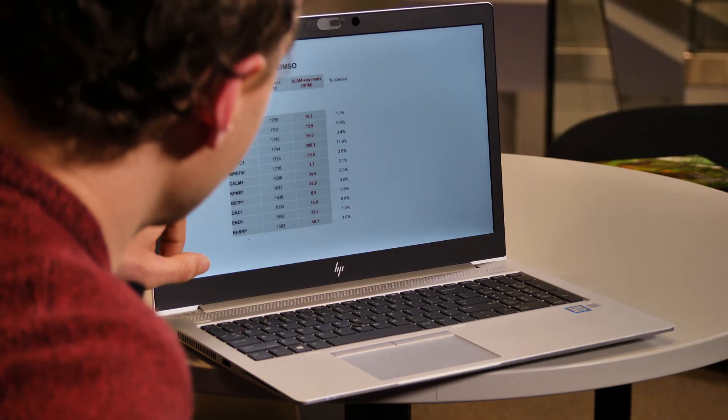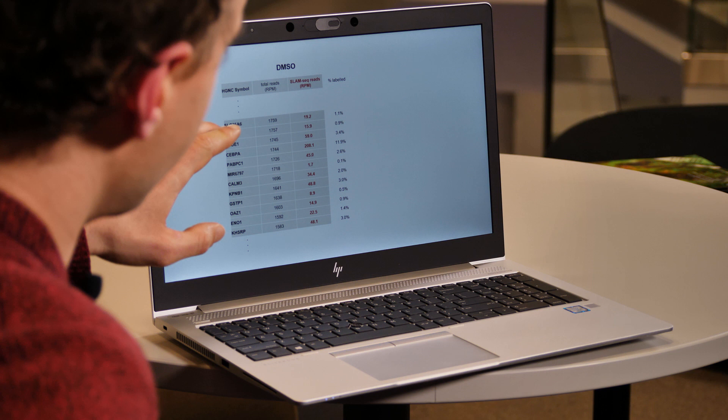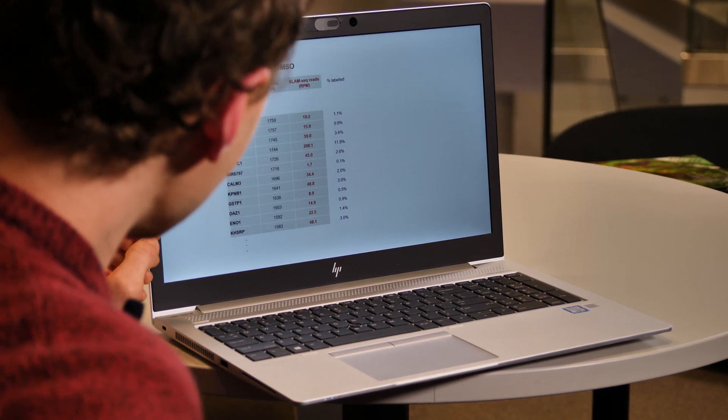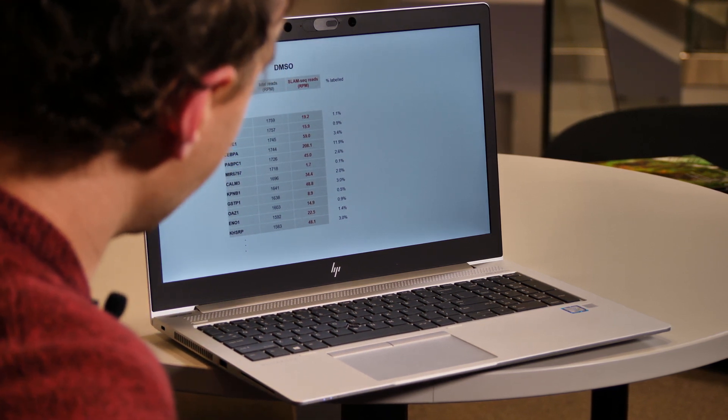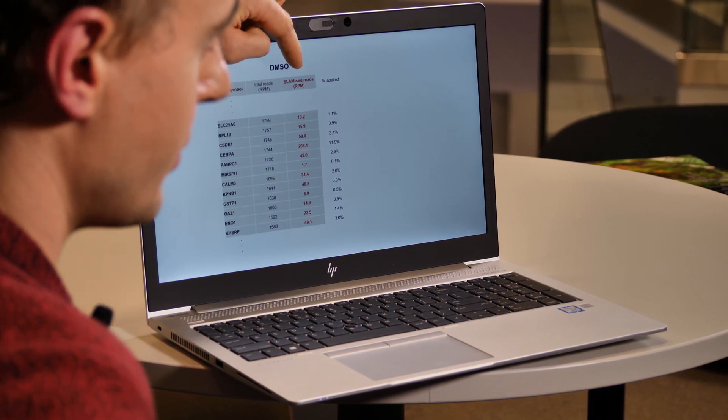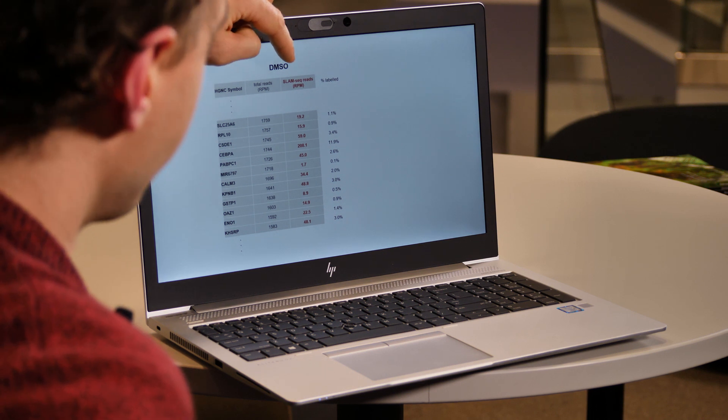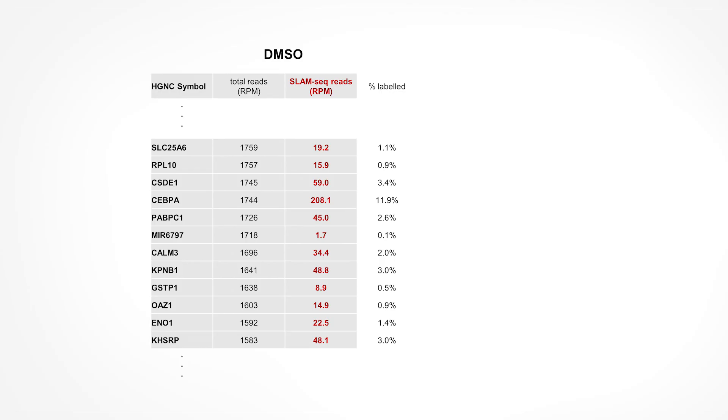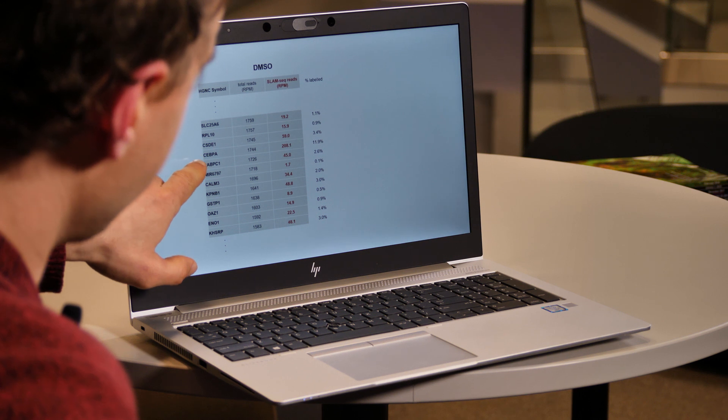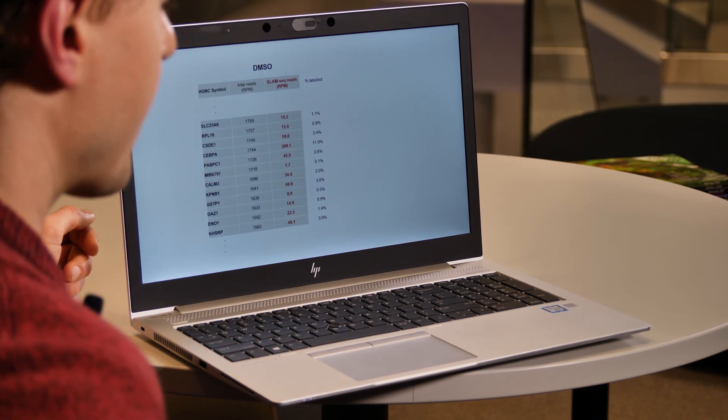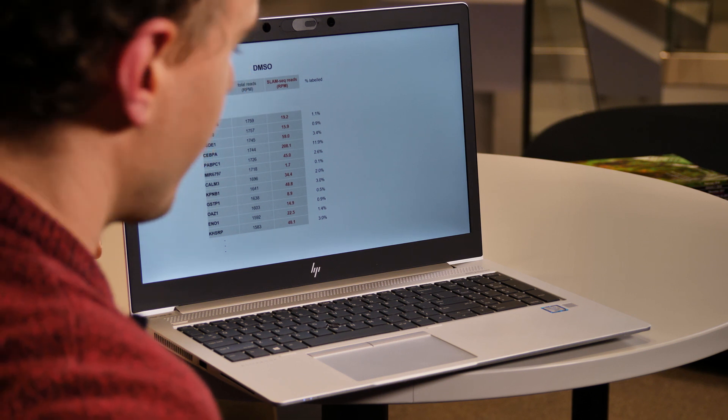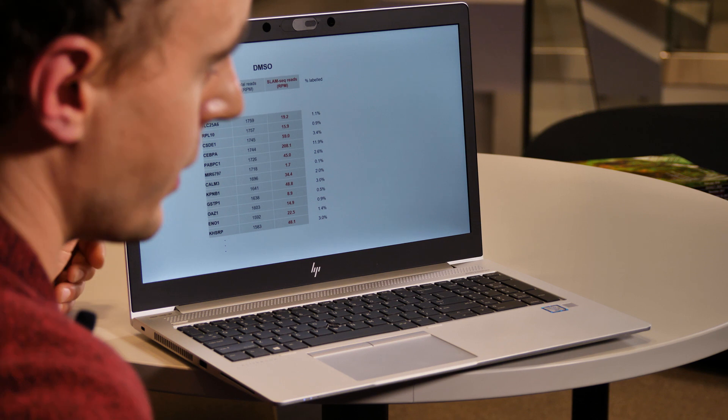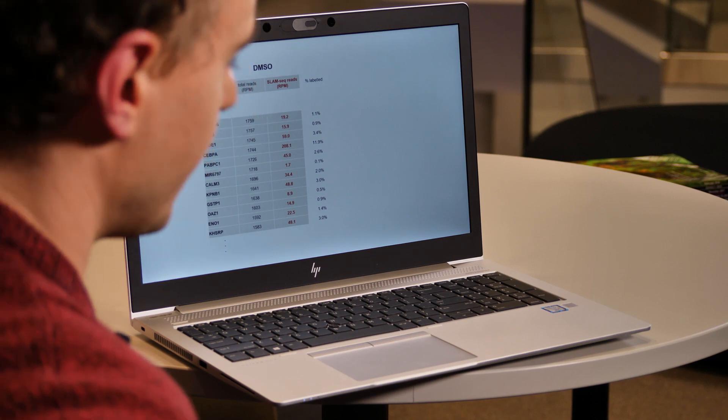SLAM-DUNK provides you with a lot of different outputs such as very elaborate quality control plots and, of course, also the mapping results. But what we want to look at now is the read counts to really quantify changes in mRNA output. So here you can see the table just for the untreated cells and you can see the normalized reads of the total RNA and specifically of the SLAM-seq reads, which in this case are the reads that have at least two T to C conversions. Now, you can appreciate that the fraction of the labeled reads among total reads is very different between different genes and that's actually exactly what we expect. So if you look at a transcription factor here, we have a very high incorporation rate corresponding to a high transcript turnover, whereas other housekeeping genes have relatively low labeling efficiencies.